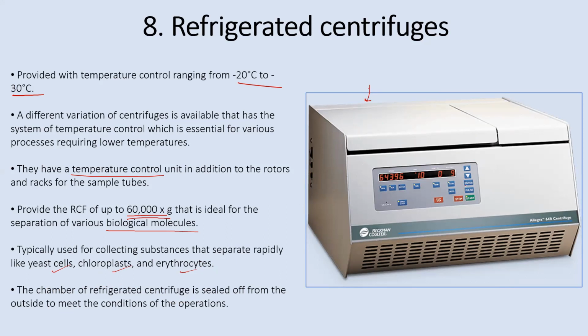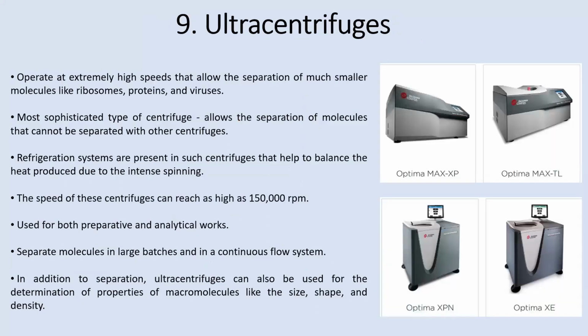You can set the conditions. You have all these buttons here. So if you close the lid, the system ensures that the particular run will run under whatever you have set, in those conditions. Then there are ultracentrifuges.